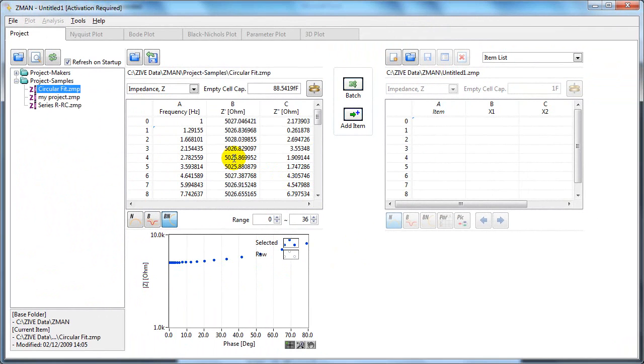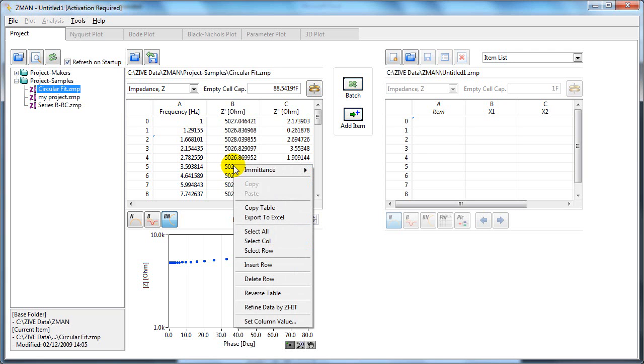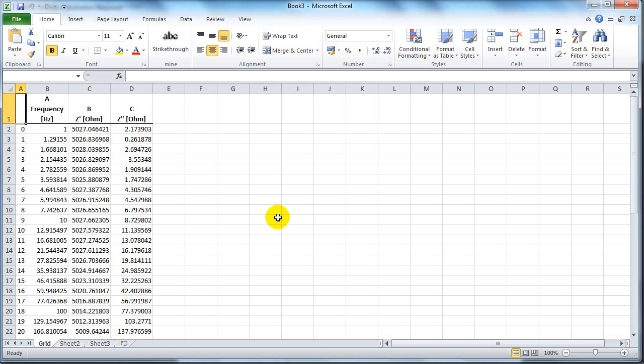You can change the values in the table by clicking them and typing in the new value. If you right click, you get a list of options as well. You can copy a table and paste it, or you can export it directly to Excel. If you click here, Excel will open up and that table has been exported.